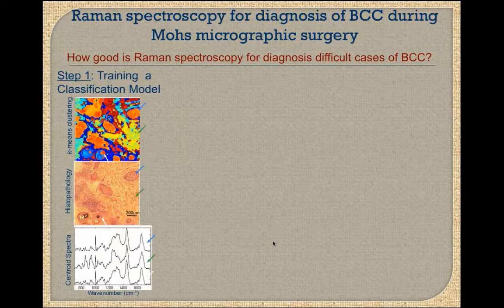And the idea is then, when a new tissue sample is used for diagnosis, the Raman spectra are run against this classification model, against this database, and then the model will check which class this new spectrum fits, and with what percentage, what sort of accuracy. In this way, a new objective diagnosis can be achieved, and also the level of accuracy can be provided.